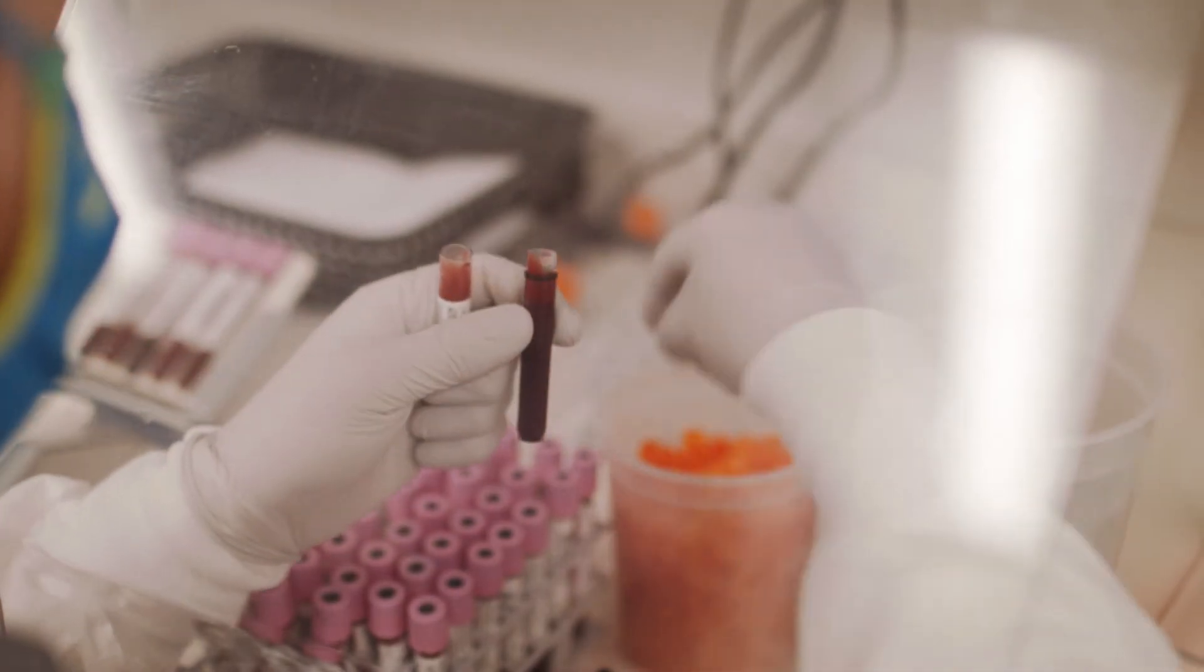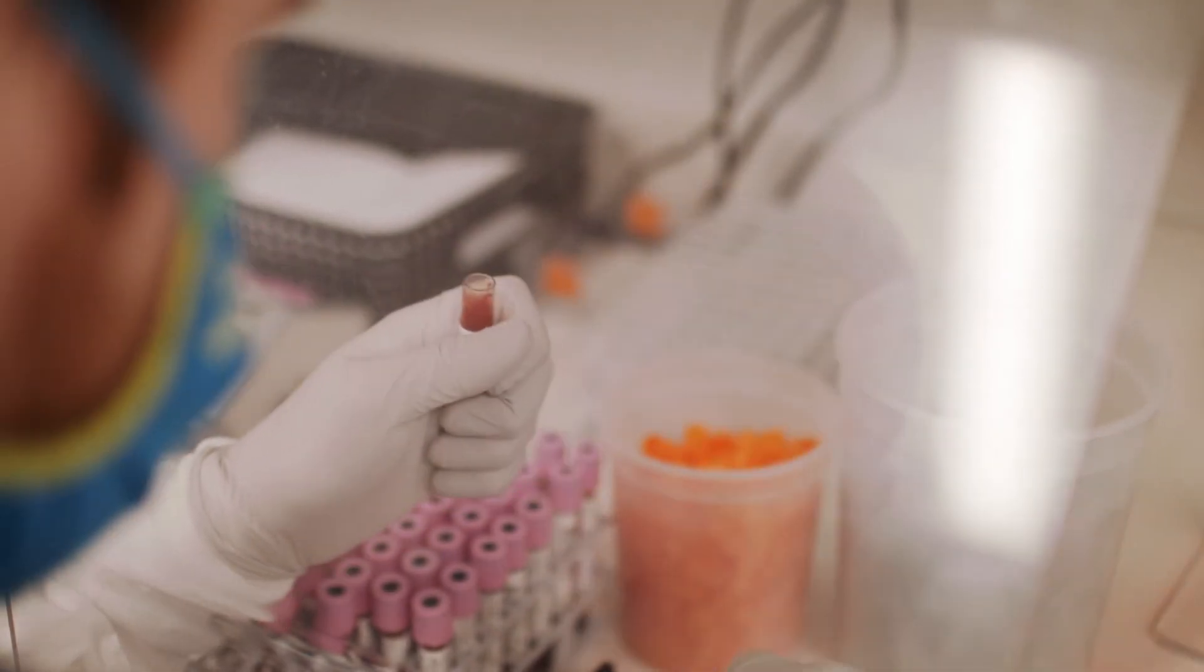Each sample that comes through the biorepository that passes through our hands isn't just a number or another tube of blood. There's a patient behind that sample.